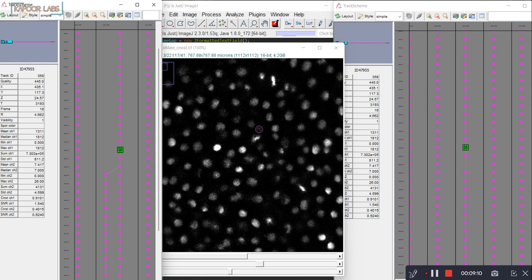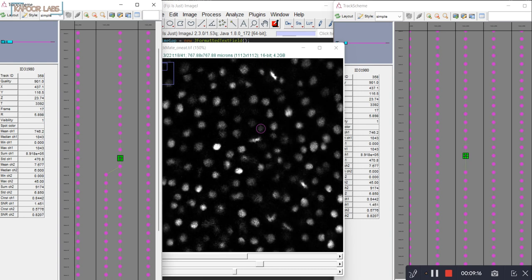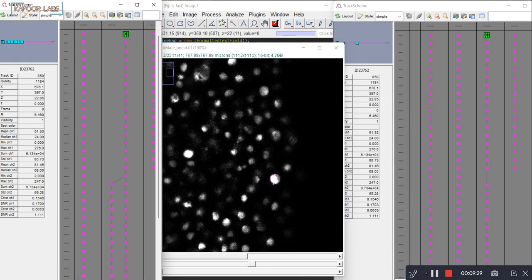So it's confusing for automated tracking algorithms like TrackMate to identify the correct division when it is next to a correct division. But Oneat knows the location of these dividing cells because it has the segmentation information. So it made the right decision to break this particular link. Now let's go and find some more.